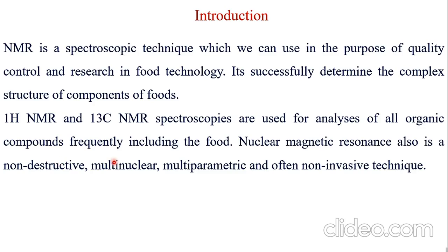1H NMR and 13C NMR spectroscopy analyze the organic compounds of the food.